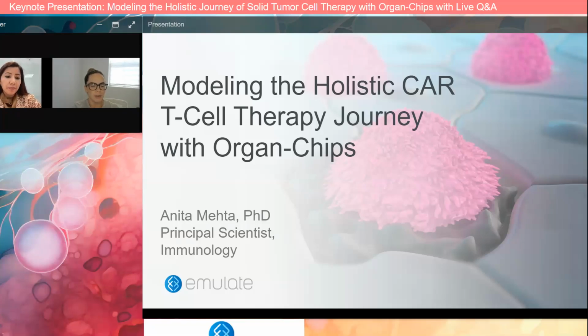All right, perfect. So we will go ahead and wrap up with this final question here. Is this workflow compatible with patient-derived organoids, PDO, or a model of the tumor microenvironment? That's a great question. We have not tested that in-house. However, this workflow is highly adaptable and can be done with patient-derived organoids.